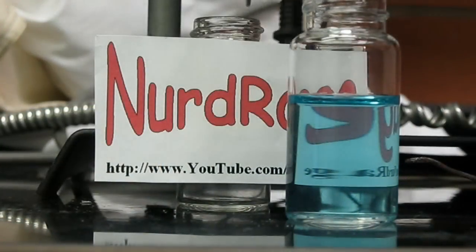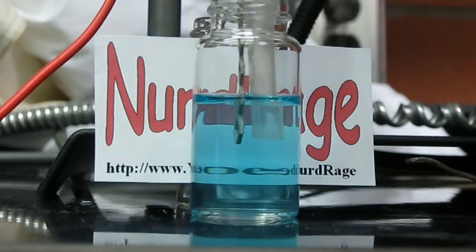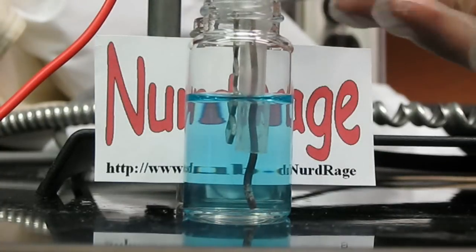Once again, we insert the electrodes into a copper sulfate solution with a platinum electrode on top with a positive power connection, and the copper electrode at the bottom with a negative power connection.